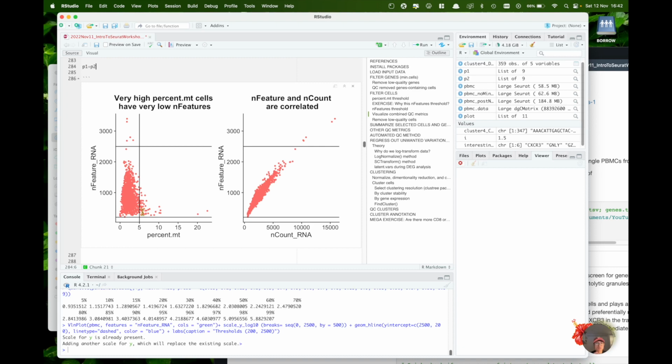And again, mitochondrial genes can be an indication of an active process, and some papers even show that mitochondrial gene expression or cell cycle genes can be useful to determine cell type or cell state. Again, the decision is yours to set where you want it, but it needs to at least visually make sense for your particular data. And you need to ensure that the things that you take out do not actually contain some biological insight and are actually low quality.